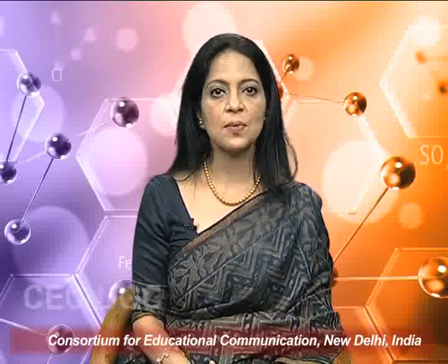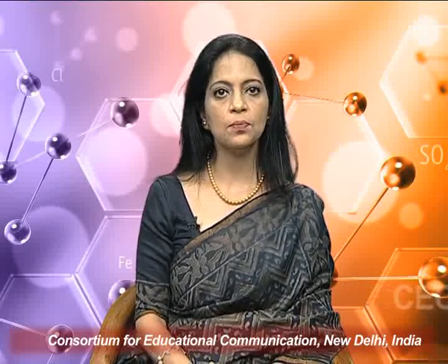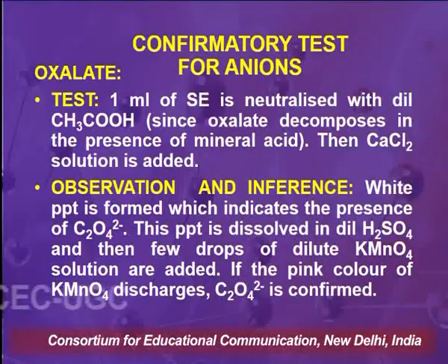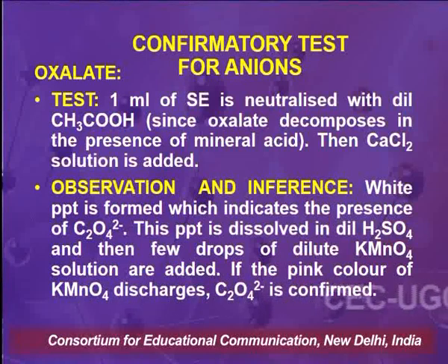Coming to the systematic test again for the next ion, which is the oxalate ion in a mixture. For this, 1 ml of the soda extract is neutralized with dilute acetic acid. Again, because oxalate decomposes in the presence of mineral acid, acetic acid is used for the neutralization of the soda extract. After that, calcium chloride solution, around again 1 ml, is added to it, and the test tube is shaken. In the observations, if white precipitate is formed, it indicates the presence of oxalate ions in the mixture.